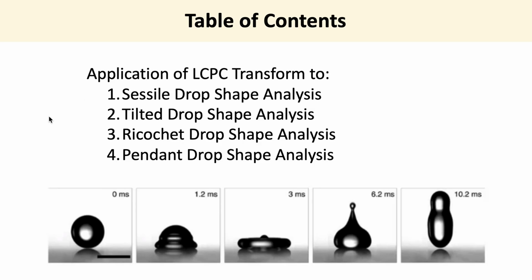In this presentation, we'll talk about applying the LCPC transform to 4 cases of drop shape analysis: sessile drop analysis, tilted drop shape analysis, ricochet drop shape, as exhibited in this image here of the liquid bouncing off the surface. And lastly, I'll talk about pendant drop shape analysis.